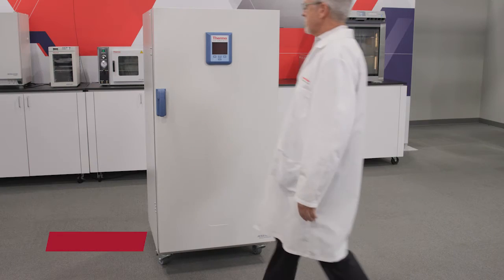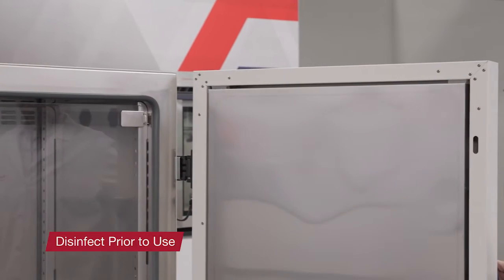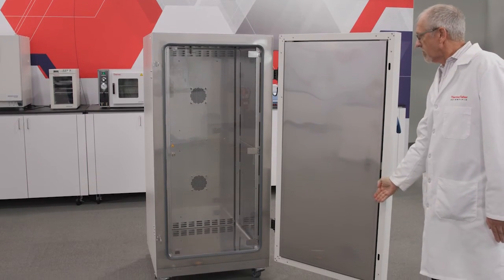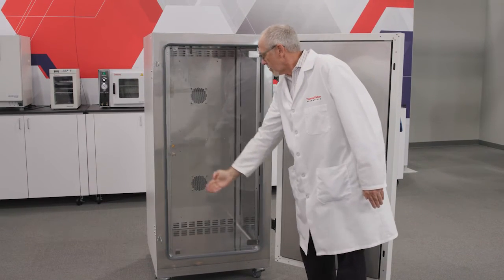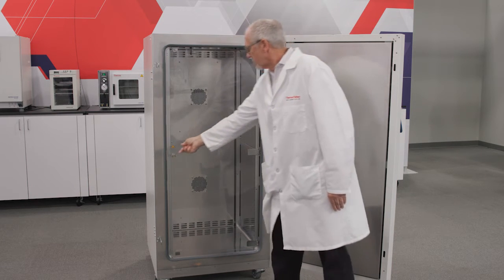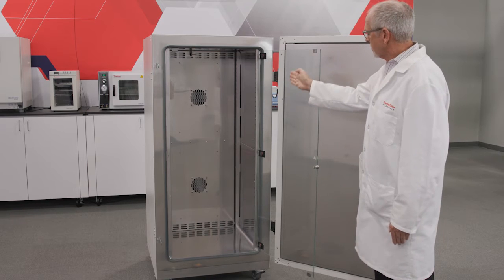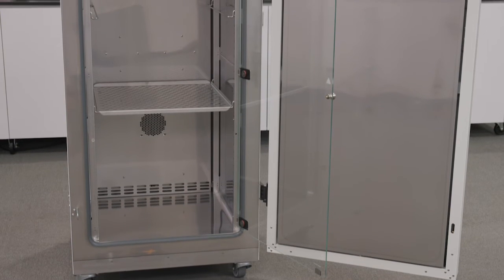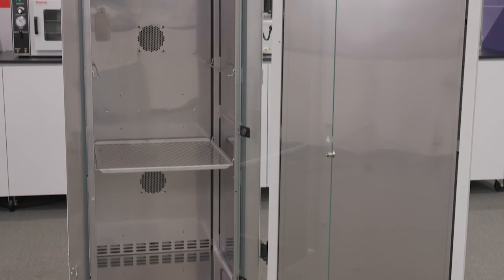Upon delivery, Heratherm refrigerated incubators are not in a sterile state. Before the initial start-up, the unit must be decontaminated. Interior components — including the support rails, shelf supports, perforated shelves, all interior surfaces, interior seals and gaskets, and the glass doors — should be inspected for cleanliness and disinfected prior to use. It is also possible to remove the air baffle from the back interior of the unit for cleaning and disinfection as well.